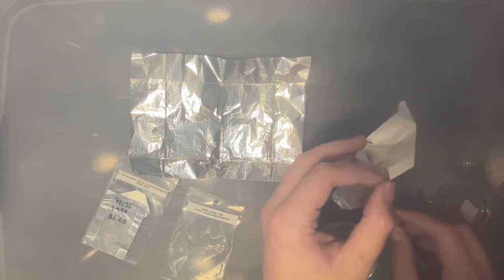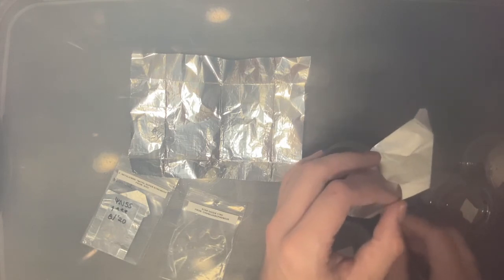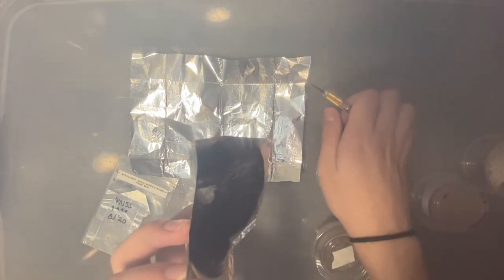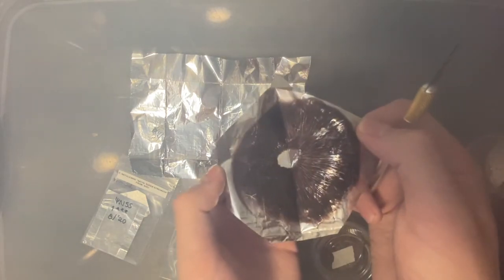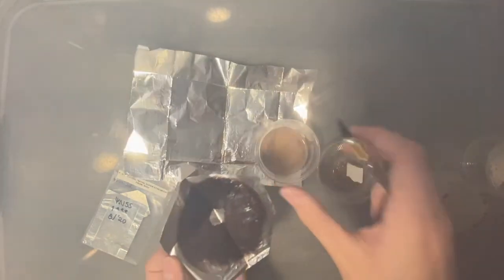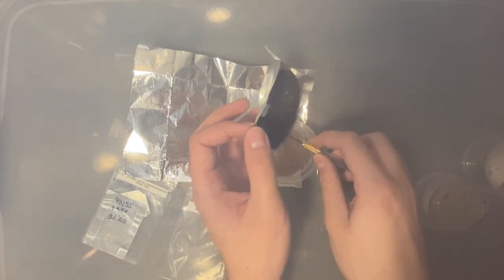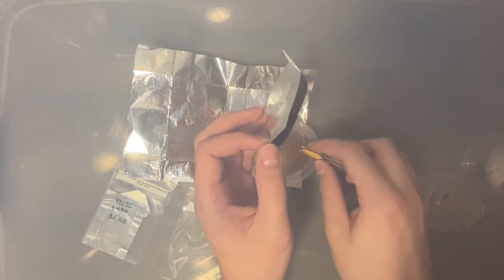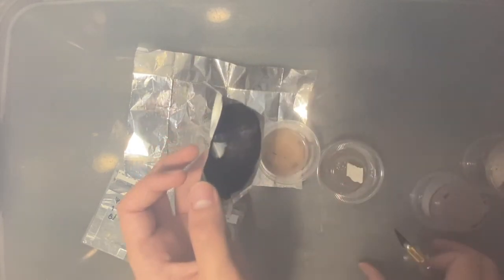All over it. I'm even gonna poke the knife in. I still can't believe how beautiful that print is. Print is huge. Yeah. We're gonna do the same here. Ooh, that was a lot of spores. I do not need this many, I know. Alright, and then just like that.